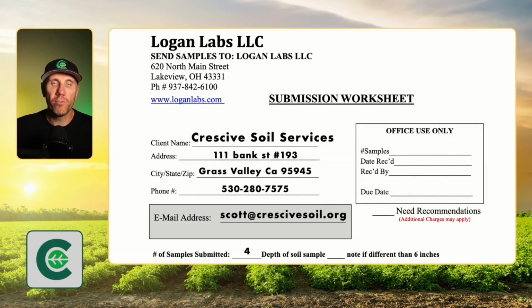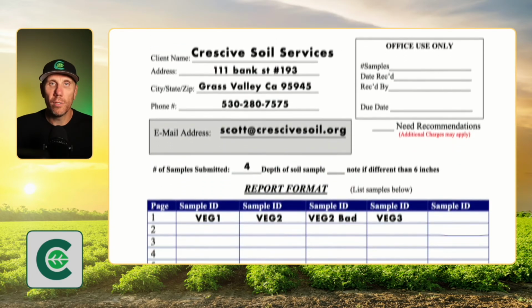Filling out the report is pretty straightforward. Fill in your information as completely as possible and at least put your email address so that they can send the data to you. You also want to label your samples with your name so it makes it easy on the lab. It's also important to fill in how many samples you've submitted. If you're getting a bulk density value, then the sample depth is really irrelevant because they're not making that assumption.